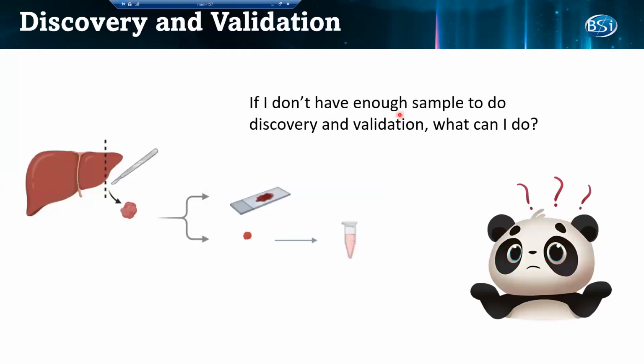Okay, and then we introduce a very new technique called hybrid DIA. Before, we mentioned that in real research or clinical research, we need to do discovery and validation.